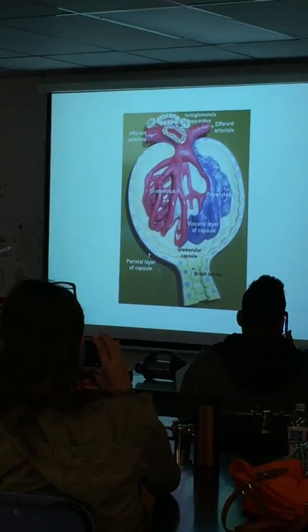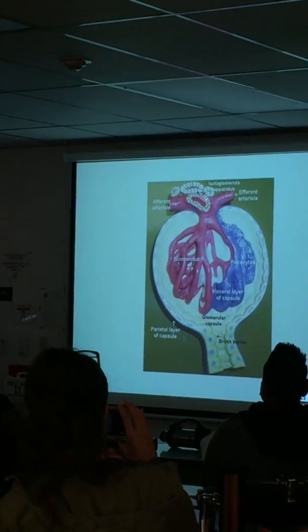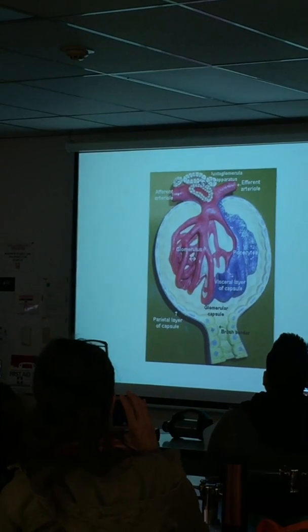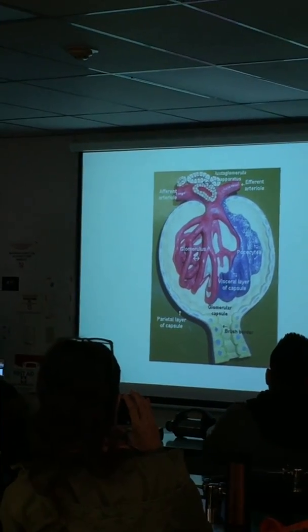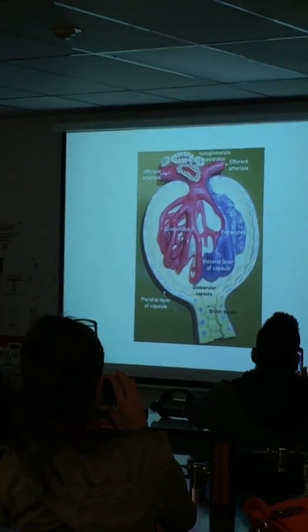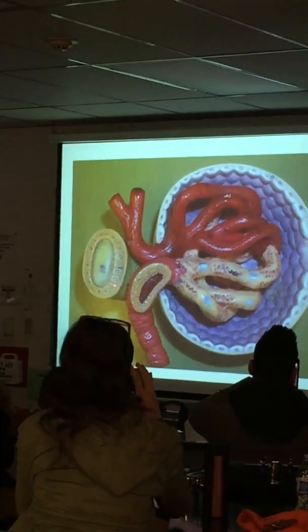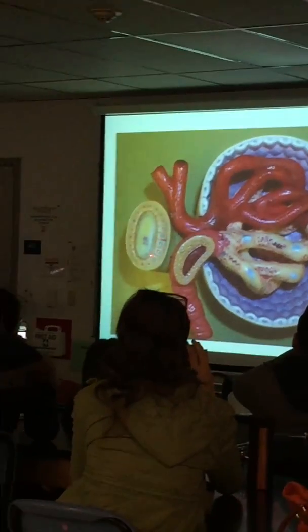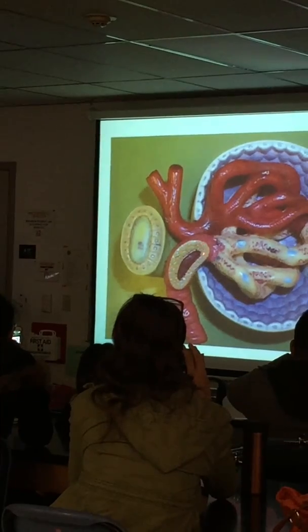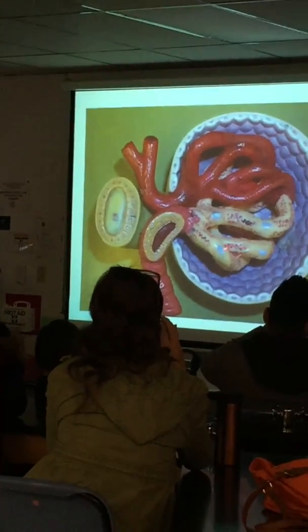So they just say juxtaglomerular apparatus, specifically know the granular cells and the macula densa. You don't just expect to see juxtaglomerular apparatus as a choice. This one, juxtaglomerular apparatus, this is macula densa of the DCT. This is the juxtaglomerular cells of the afferent arteriole. That's efferent arteriole. This is our visceral layer of the Bowman's capsule.